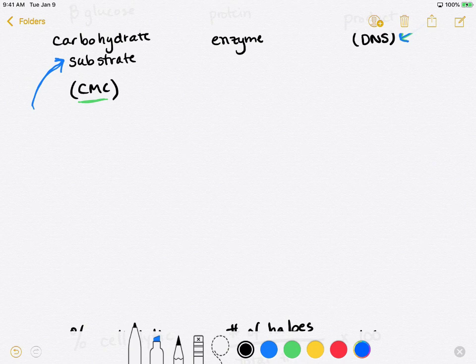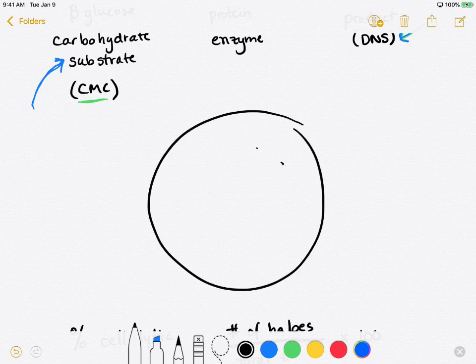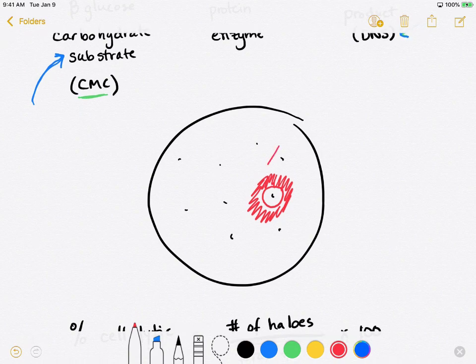as you looked at the plate, you had colonies throughout the plate, and the plate was mostly red, but around some of the colonies, there would be a clearing where it would be white, and then it would be red everywhere out. This was not as beautiful as this. We'll look at another picture of this at the very end where you can see real examples. But this is generally what you saw. Colonies growing, some of the colonies growing with red all around them, some colonies growing with what we would call a halo.